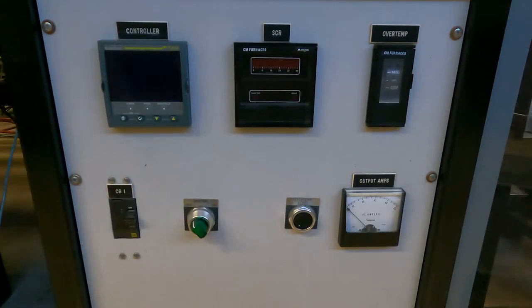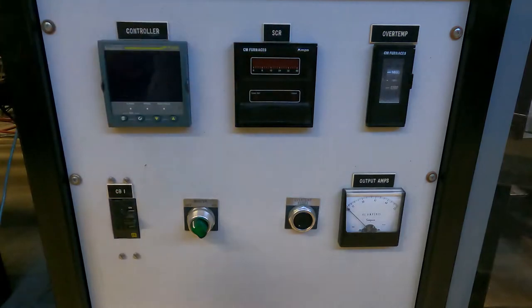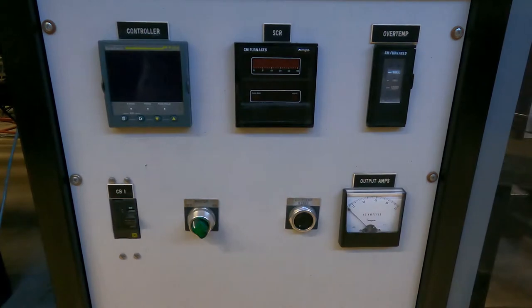Alright everybody, here's our box for our furnace controller. This is the one for the vertical tube furnace, but they're all generally the same idea. We use Eurotherm 3504 controller panels. I think they're a little outdated at this point, but they still work great. The SCR and the overtemp gauge on the other furnaces are a little bit different, and even the output amps meter down here is sometimes a little bit different, but they all do basically the same thing.